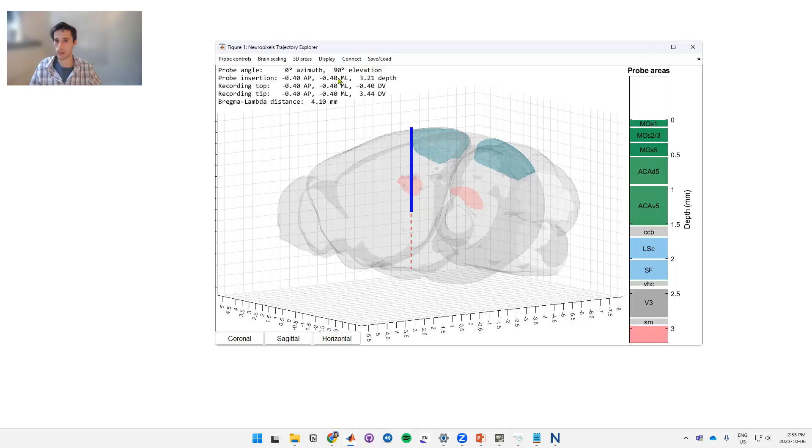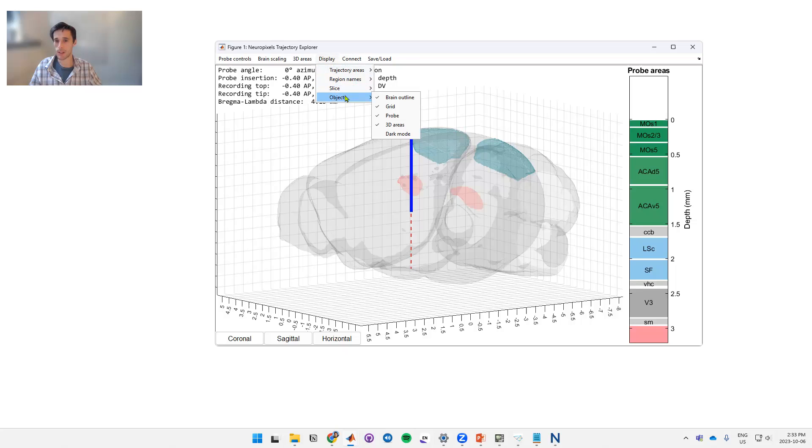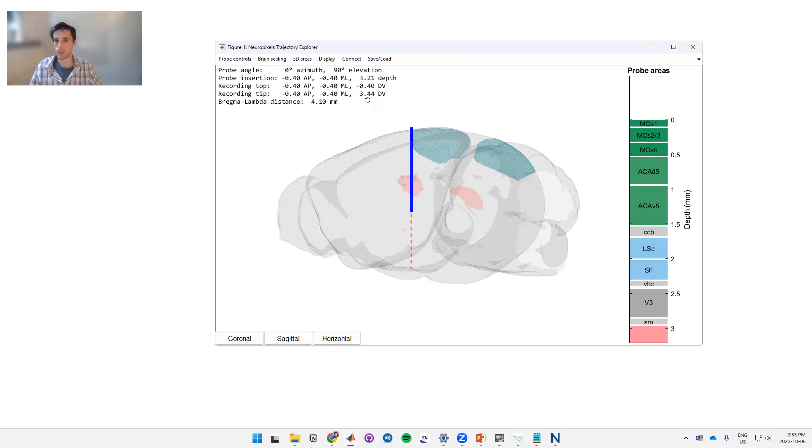We can also turn objects off and on. So for example we can have a grid. We can turn the brain off. Anything that we want to turn off and on can be done through these bottom objects.